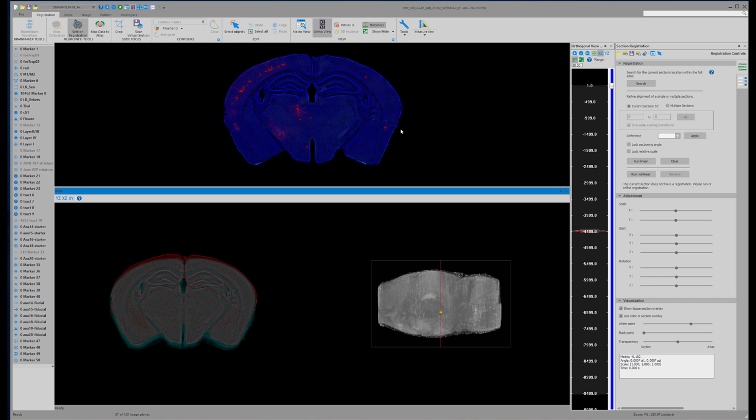Okay, so this is a section through somewhat the middle of the brain, and the reason I show this is that various structures, depending on where they're located in the brain, you can tell where they sit in the rostrocaudal axis.